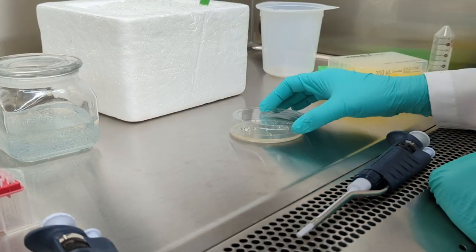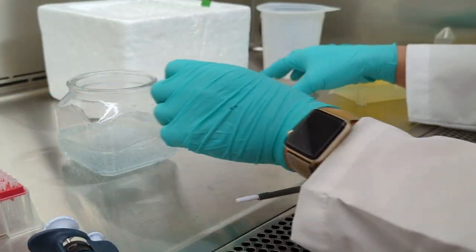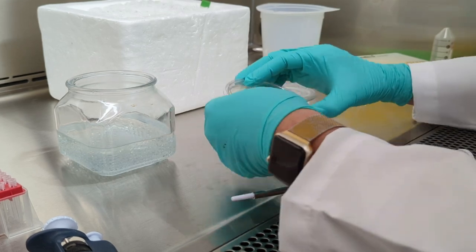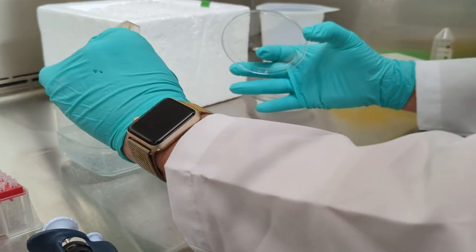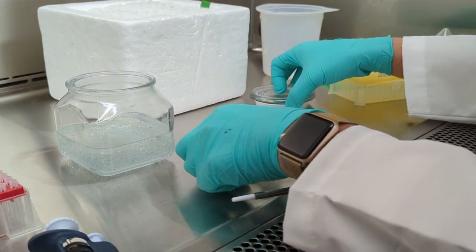One other note, if you use your own vector with antibiotic resistance other than ampicillin, simply add transformation mix into 200 microliters of recovery media and shake for one hour, then plate. Recovery culture is absolutely needed in this case as well.